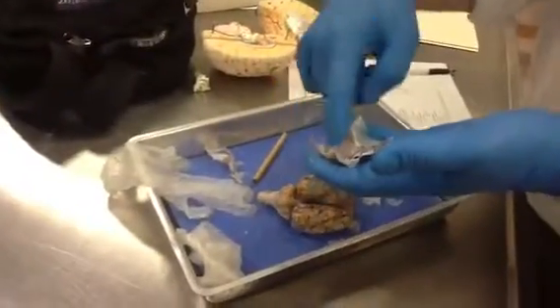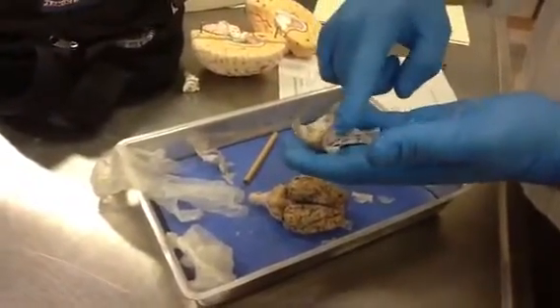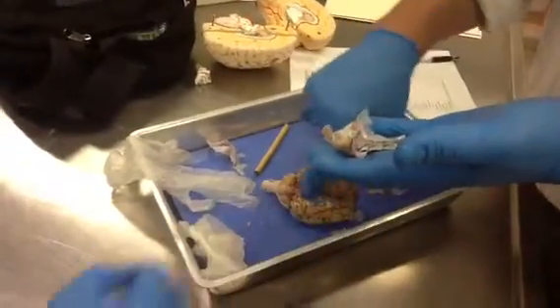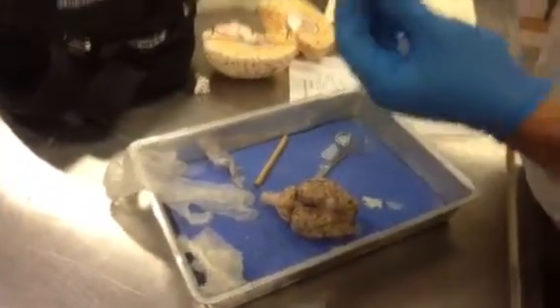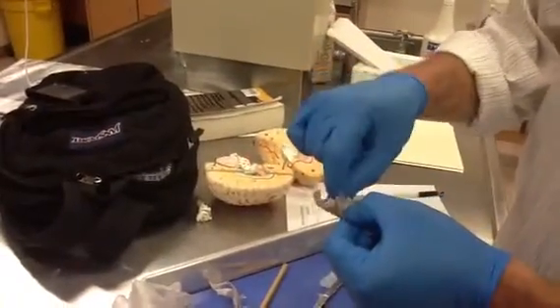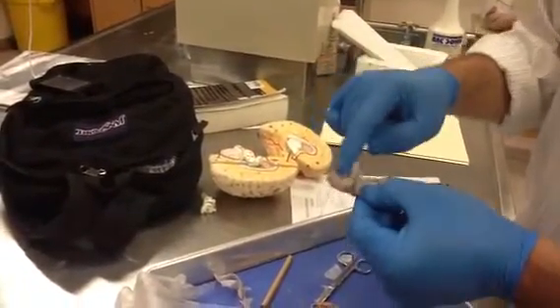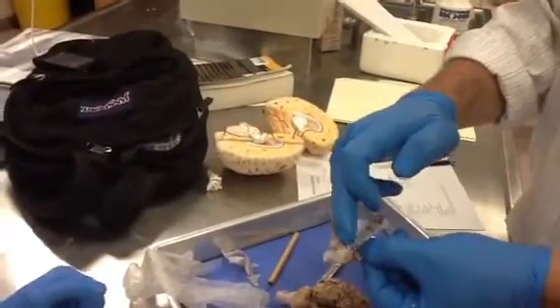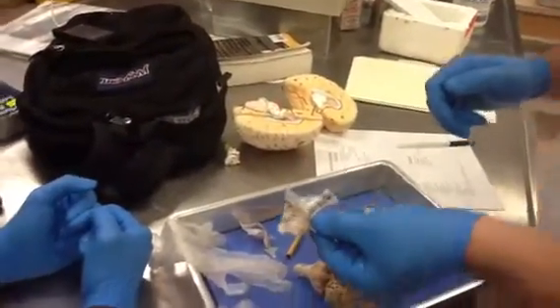Right? That's where that was. The two hemispheres are going to be on this side. This is the falx cerebri with the superior sagittal sinus between it, right in there. And then see this little wall between where the cerebellum is and the cerebrum? That's called the tentorium cerebelli. Kind of looks like a tent a little bit. Tentorium cerebelli. Is it filming right now?